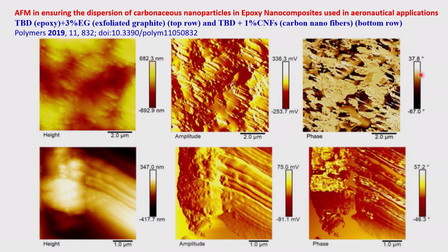So phase comes from the degree, the orientation things, and this potential difference gives you the topological things, and this will give you the shape or the height parameter. So these are the kinds of things that are very helpful in comparing with the properties that you have.